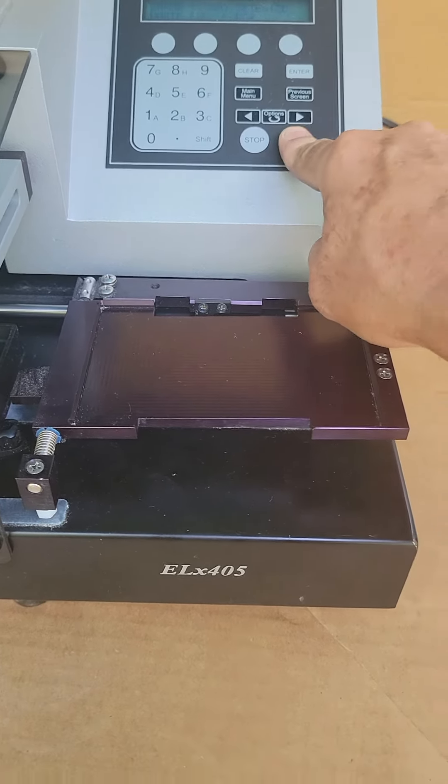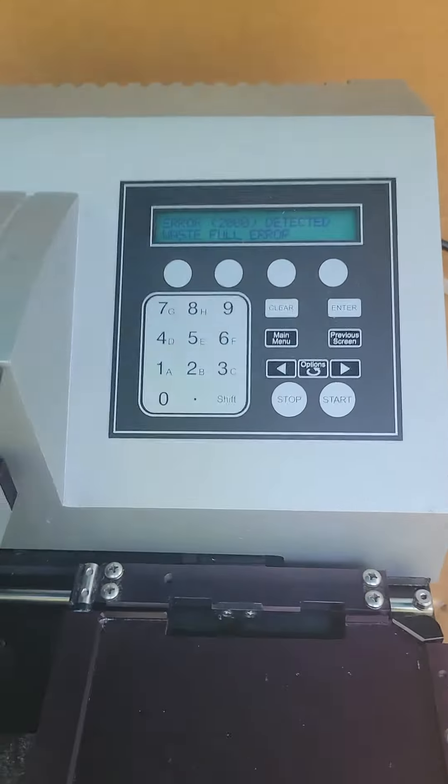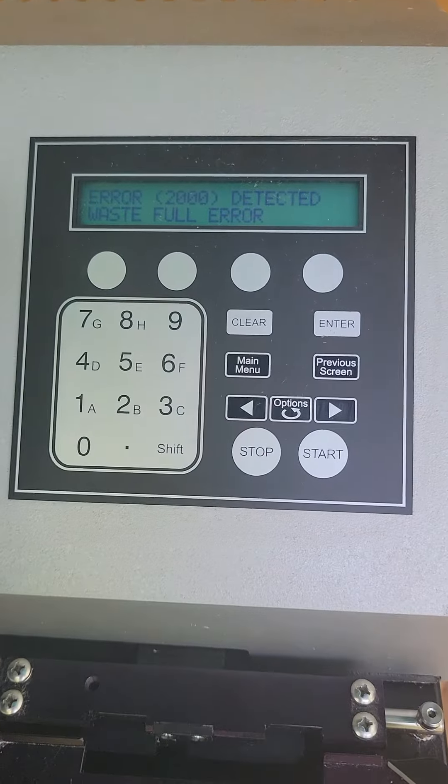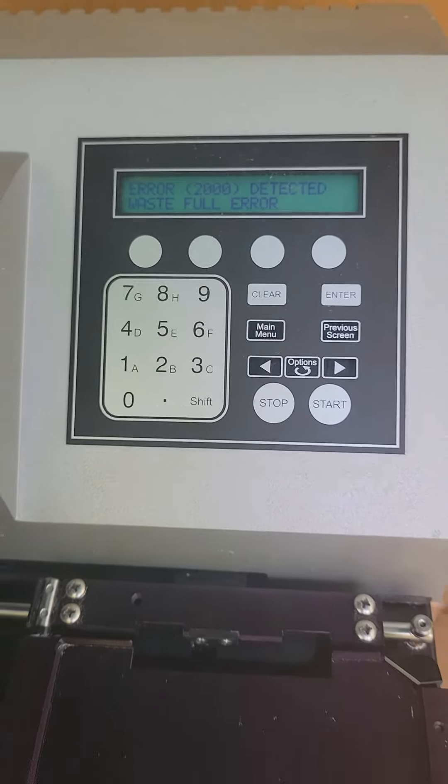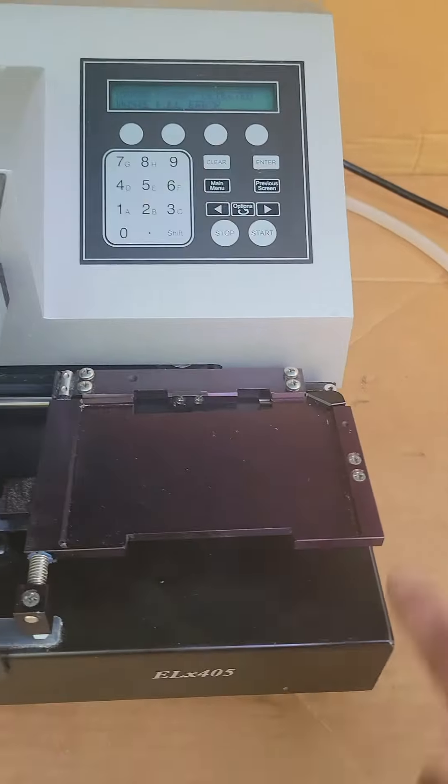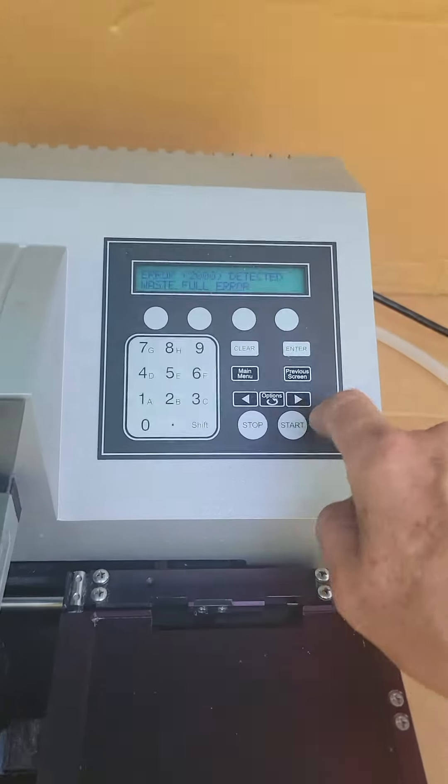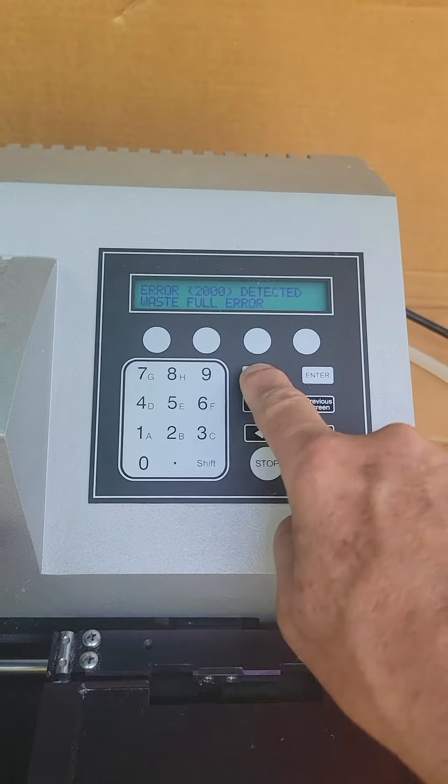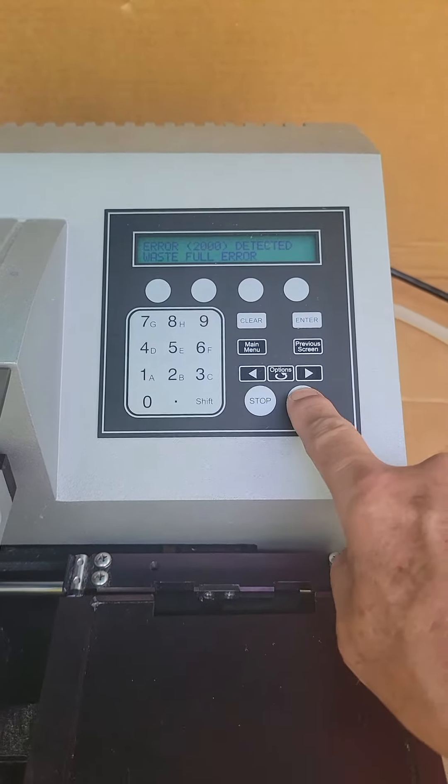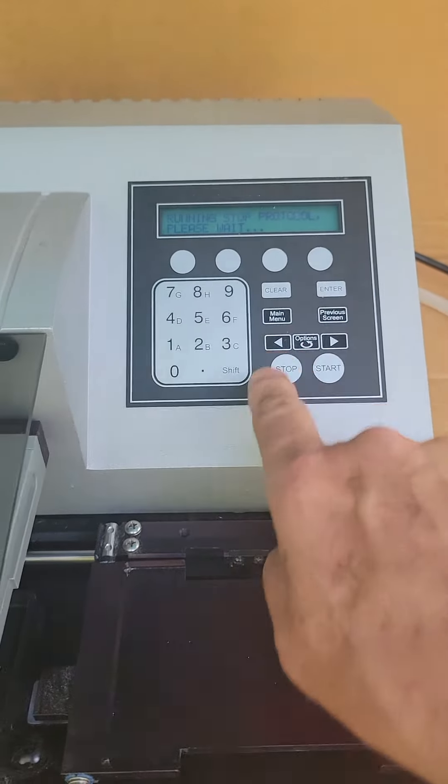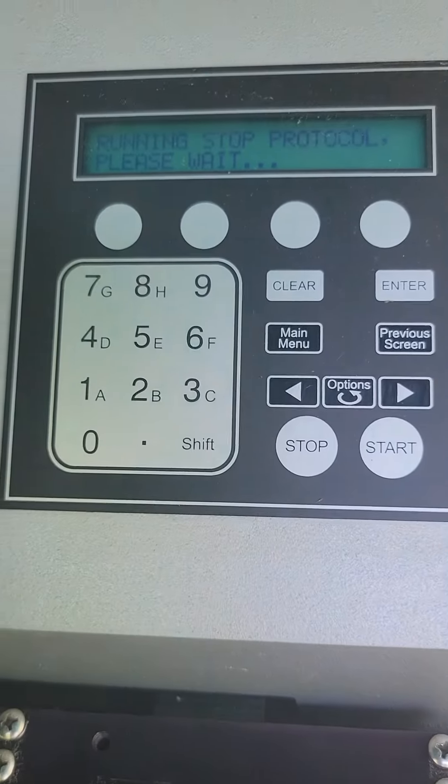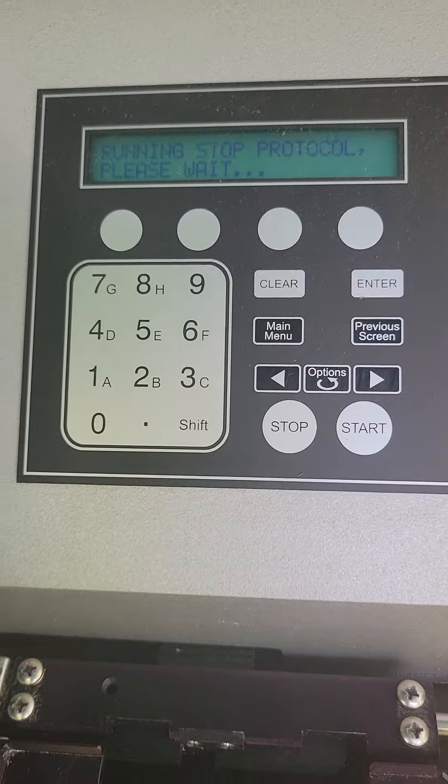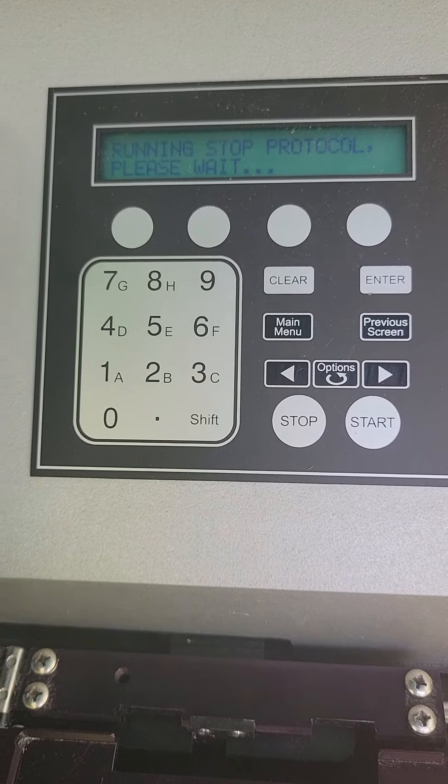So we have, of course, because it's not connected, it shows the wasteful error. Stop, clear. And running protocol. Just going through all the motions so you guys can see how this unit is working.